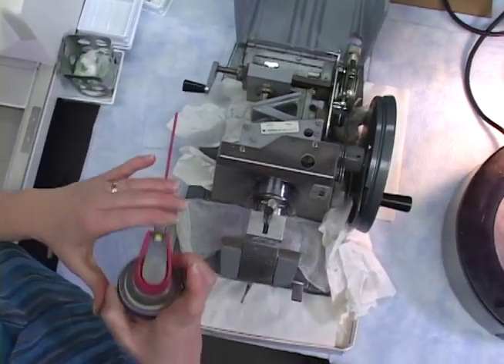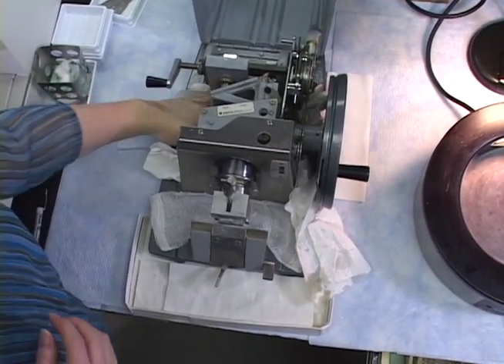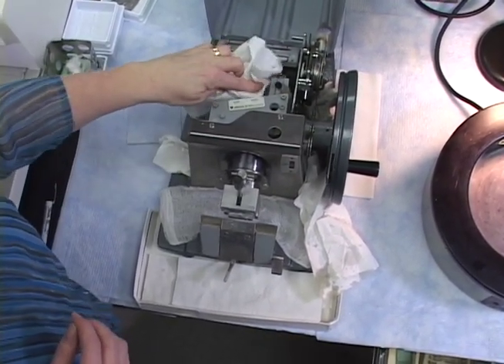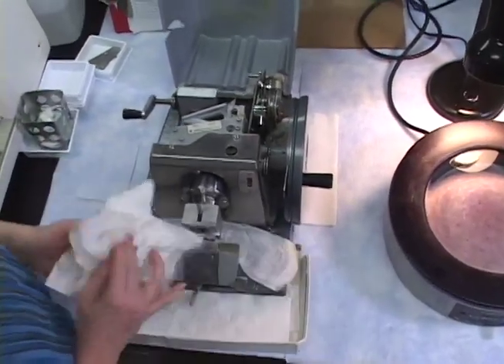Then I wipe things up a little bit. I don't want all that residual oil everywhere. There's no sense in that. We don't want oil where we don't want it to be. And that's it.